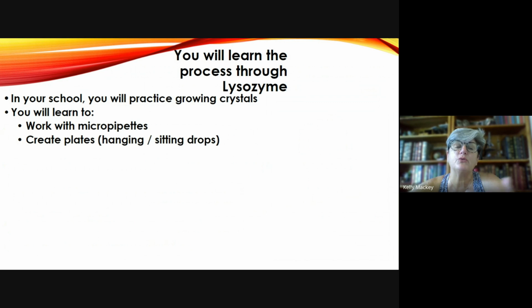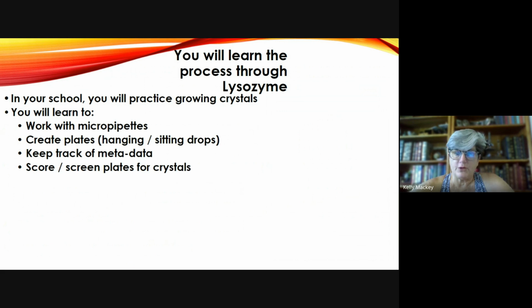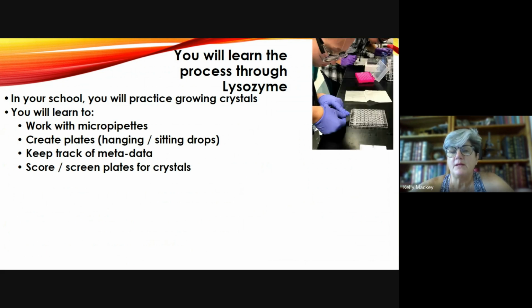How to actually create the plates. Depending on the equipment your school has, you may do hanging drops, you may do sitting drops, you may do both. You also are going to have to learn to keep track of metadata and get familiar with all the different metadata that there is out there to be collected. After a certain amount of time, you will then look at your plates and screen them to see which conditions actually have crystals. So here's an example of what you would be doing.